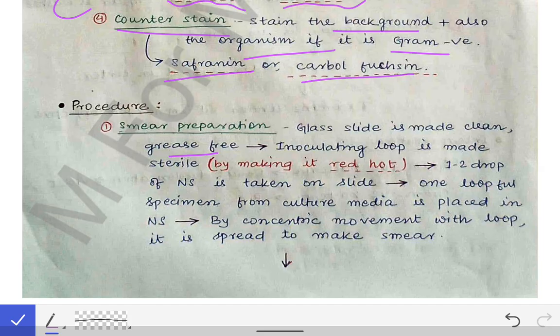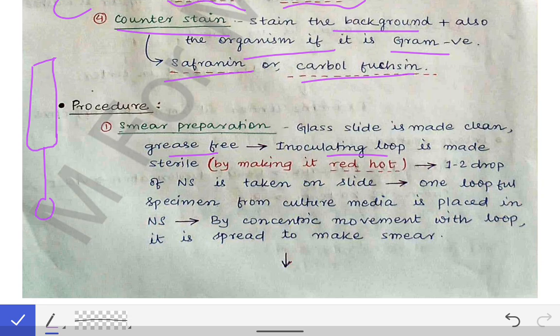After heating, we wipe the slide with a cotton cloth to make it a clean glass slide. Then we take an inoculating loop — it has a handle with a wire that is round at the end. This is called the inoculation loop.